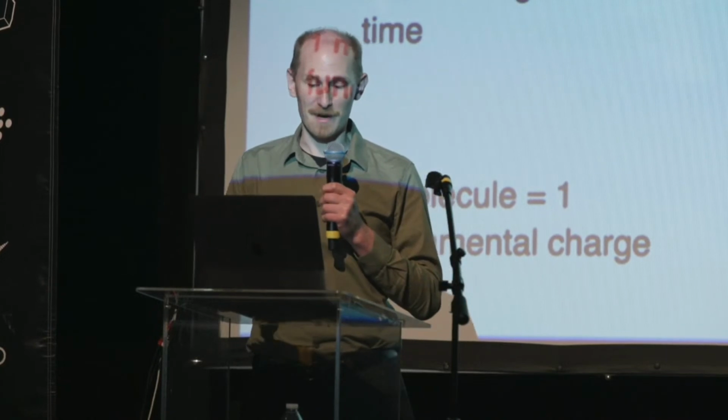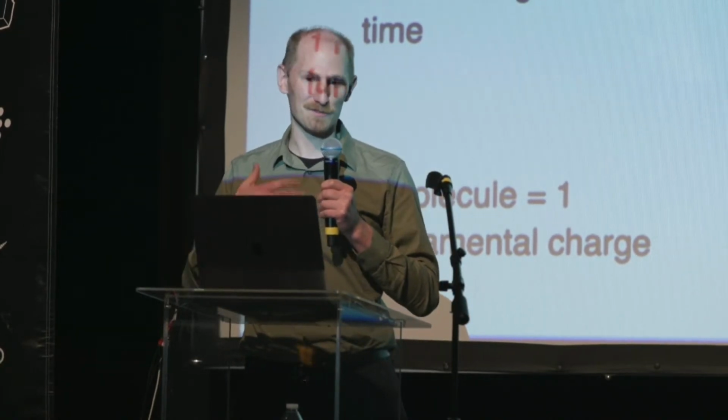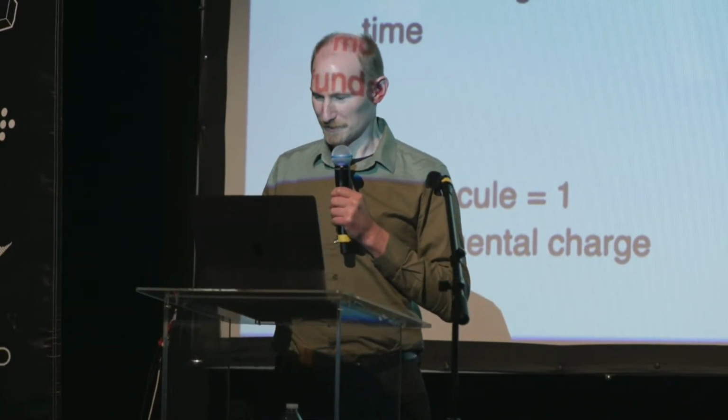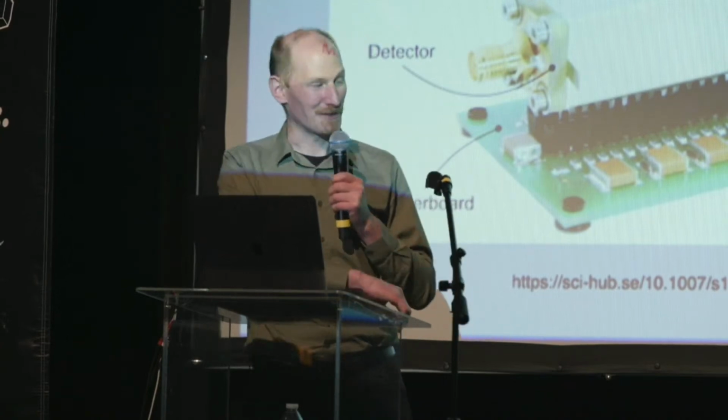We're definitely in the range of something that can be smelled. So smell is very sensitive. Even dog smell is about part per trillion sensitivity. And these machines are absolutely in that realm, even on their own. But there's one last trick I want to show you that makes them even better. Oh, sorry, one other thing.